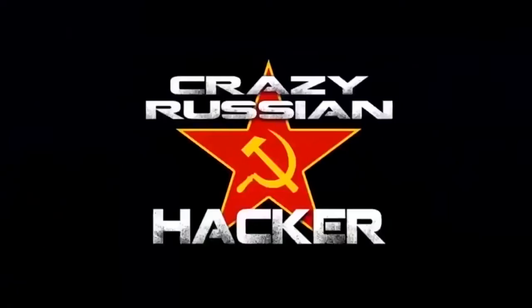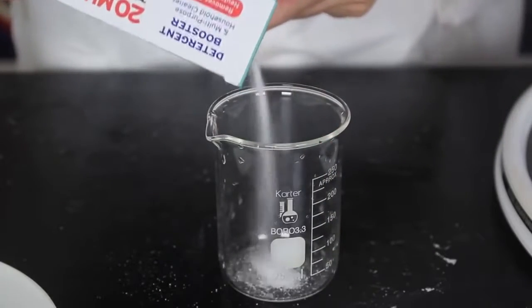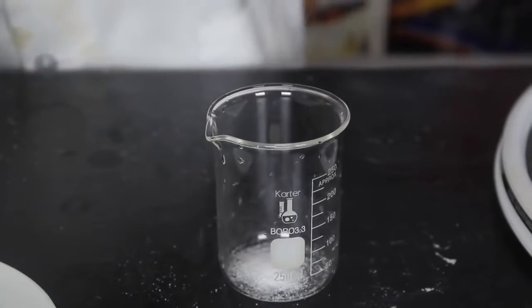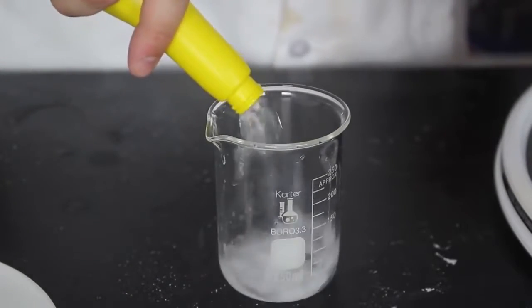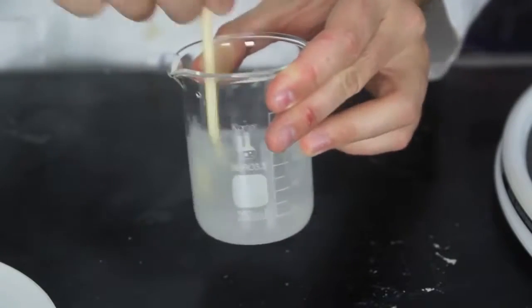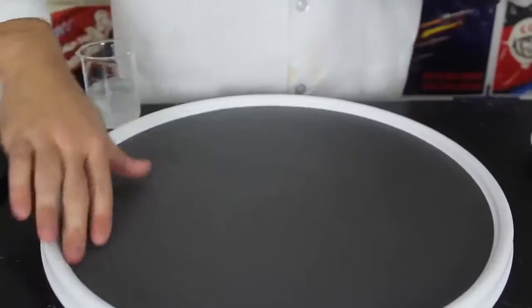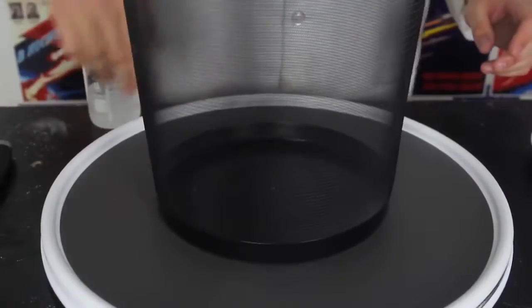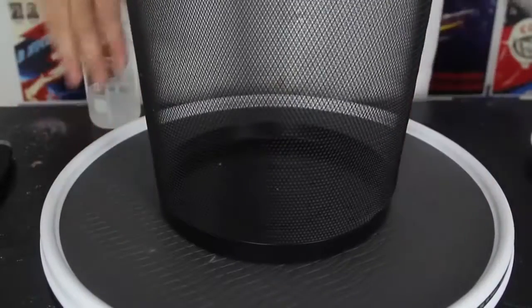Exploding paper. First thing we're going to do is put a little bit of borax in there, very little bit, just this much. And then we're gonna pour ethanol. Now we're gonna need to mix it all up. Kids, do not try this at home. Then we're gonna bring the spinning tray back and this garbage bin. And we need to find a center. This is close enough.